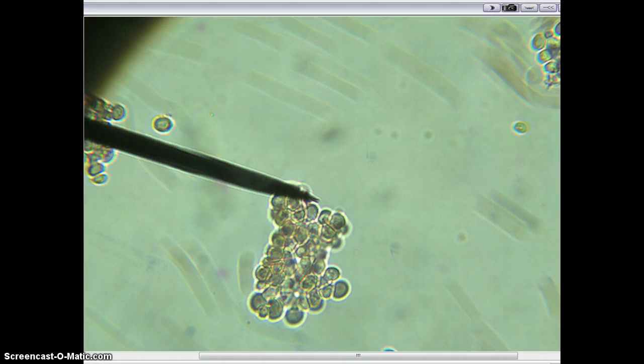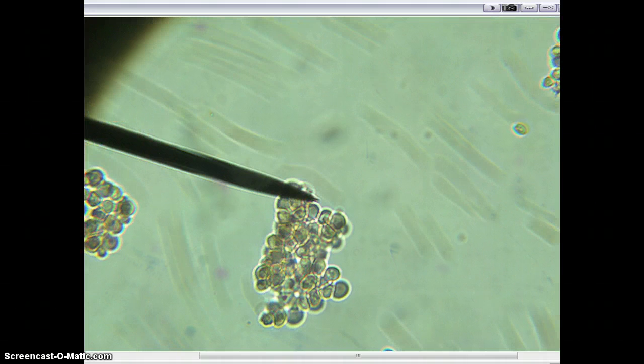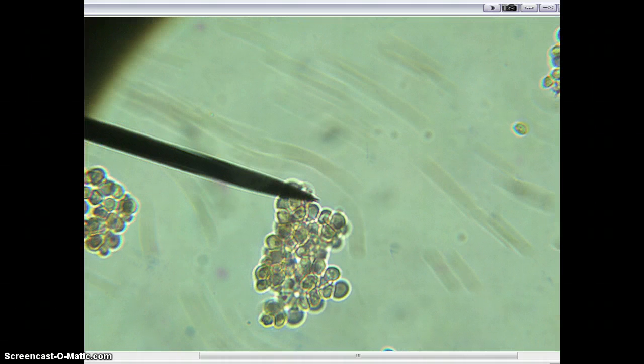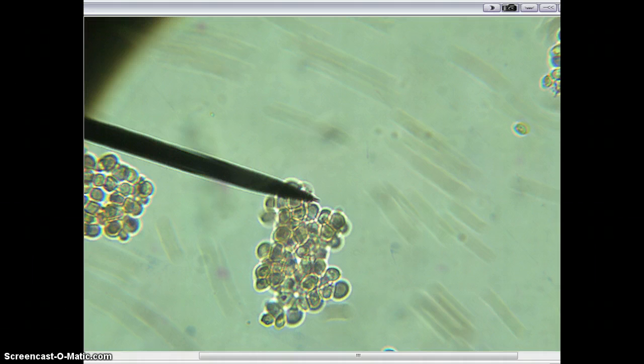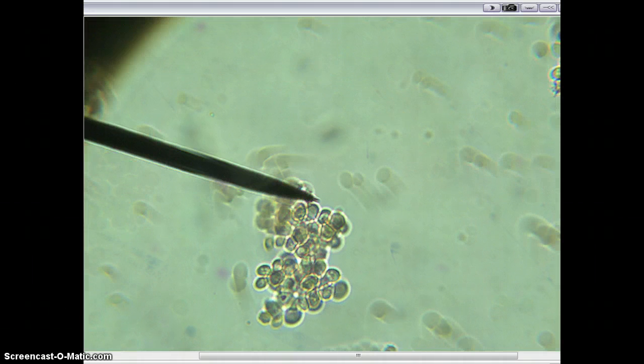And now we have a whole bunch of dead yeast cells kind of all clumped together, and they do not have the red stain on the inside of them. You may see red around the edges, but not on the inside.